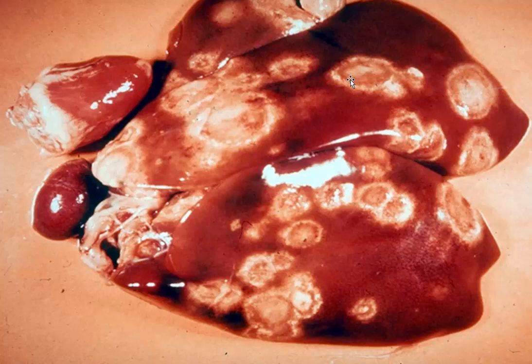Sometimes with overwhelming infections, the animals will die very quickly. They'll become cyanotic. Their heads will swell. That's why it's called blackhead. Okay, not every animal. A lot of animals will survive for a while, so you may see granuloma formation and the presence of the trophozoites both in areas of necrosis and in areas of granulomatous inflammation, sometimes intracellular within big multinucleated giant cells. The other organ that I am looking for is the cecum. It causes a necrotizing typhlitis.